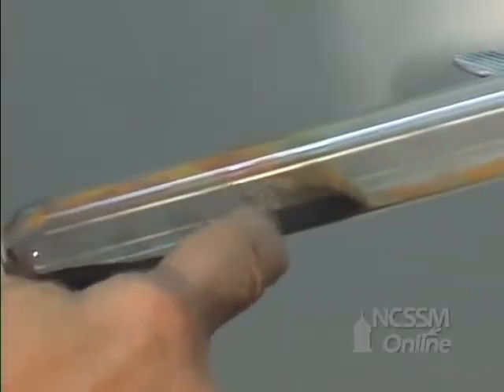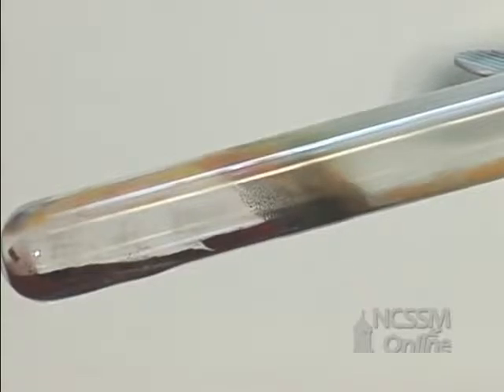The mercury metal we can see as a metallic gray ring in the test tube.